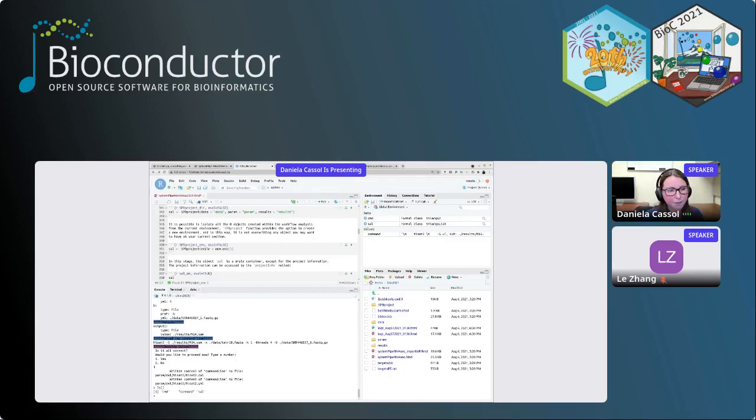I just have those 3 objects I just created, but I create some R objects when I run the workflow. That is in a new environment, which keeps your current session clean and avoids overwriting anything you may have in your current environment. And I guess that is a very powerful thing, to keep everything separate.